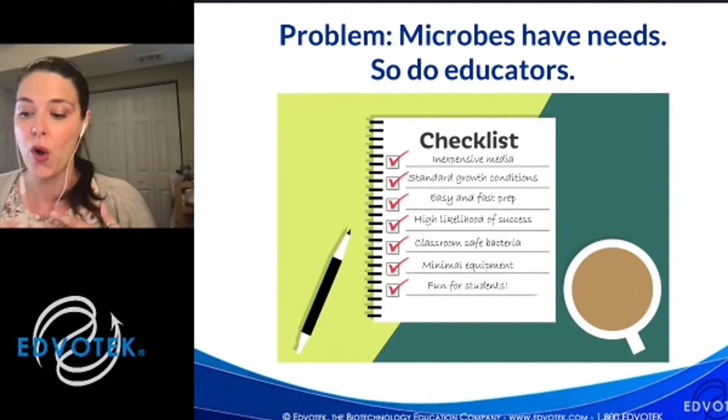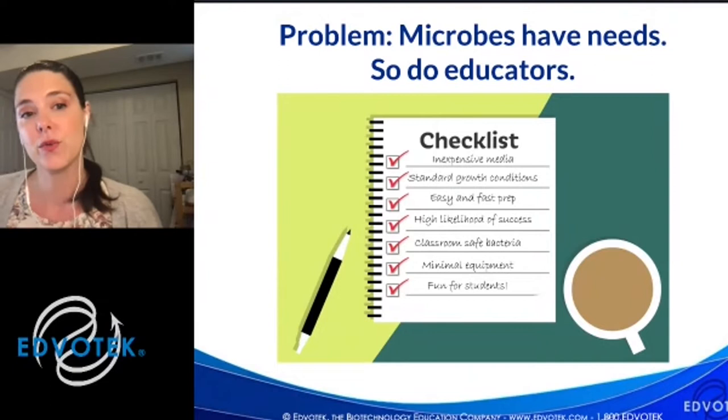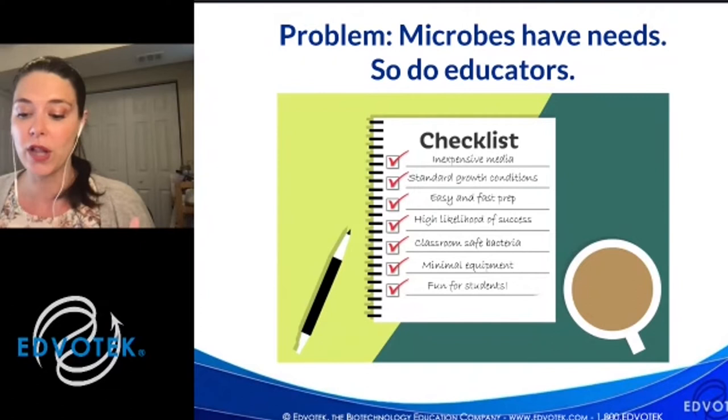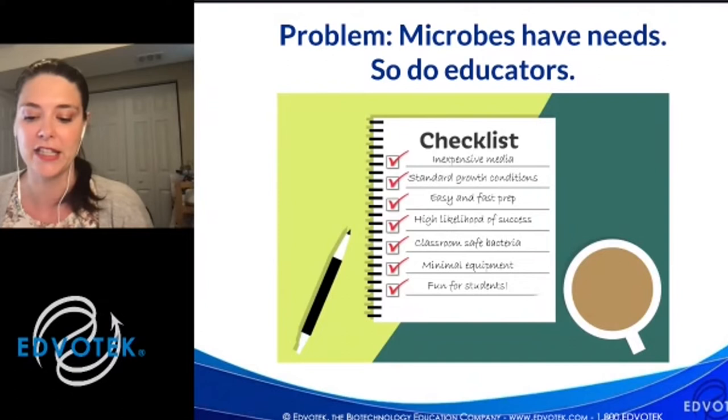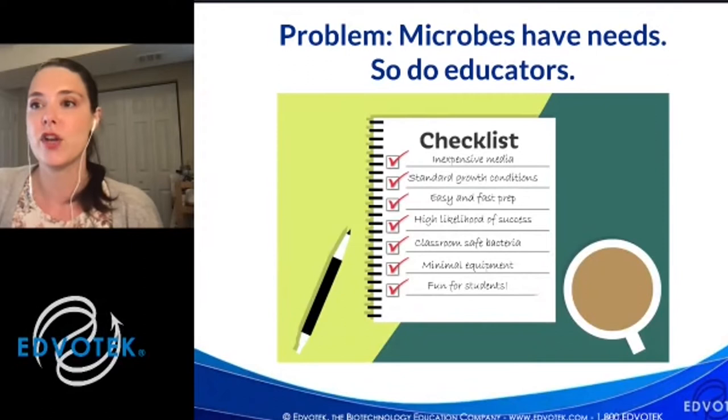And a high percentage of success. And they wanted these things to create their agar art. And so we decided to work with components that we had on hand that we already used in our experiments, like E. coli, which can produce white colonies, Serratia, which give red, Micrococcus that give yellow, and they all grow on LB media, but they do grow at different rates and their colors develop at different rates in our experience, which was giving us inconsistent results.